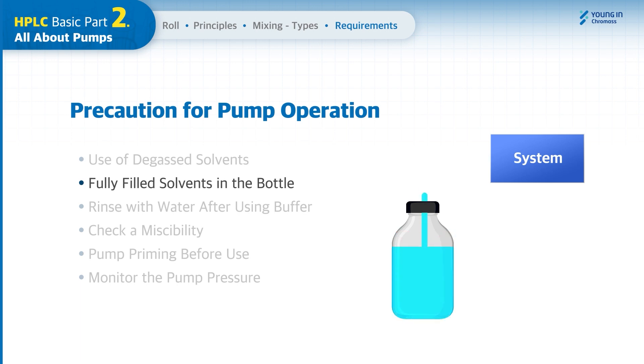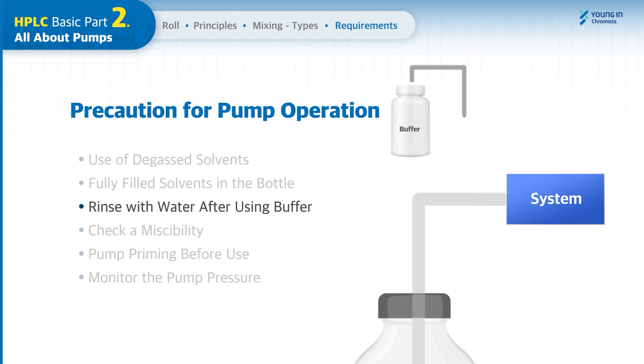So you need to check whether the solvent is filled in the bottle before use. When using a buffer, there may be salts remaining on the surfaces where the solvents flow. Therefore, you must fully rinse the system with water after using a buffer.